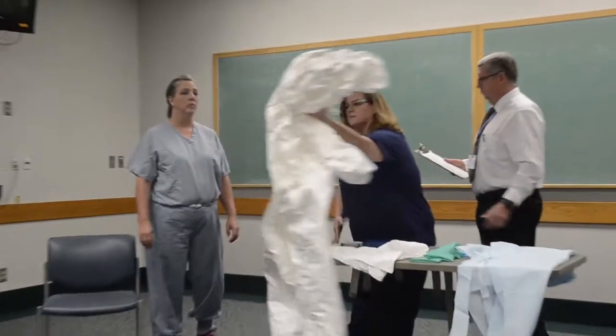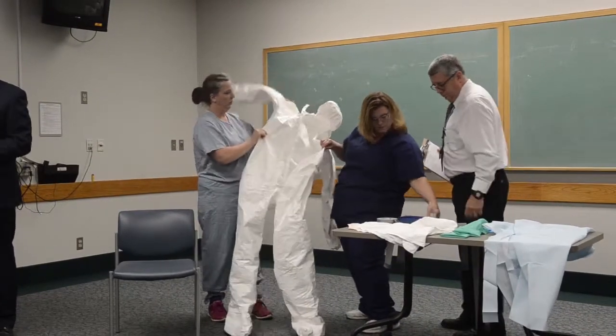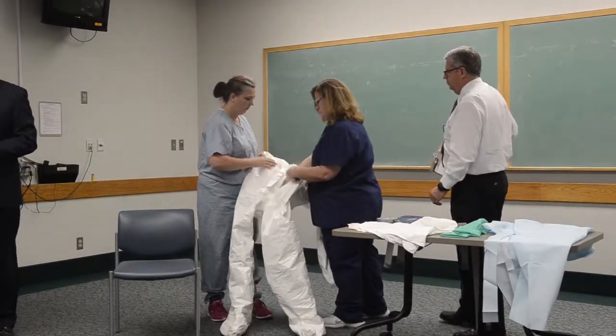Today we're going to demonstrate donning, or putting on, the appropriate PPE required for an Ebola patient. This PPE actually exceeds CDC guidelines. The PPE is water impermeable at all levels and it covers all skin — in other words, there are no openings. She is totally encapsulated.